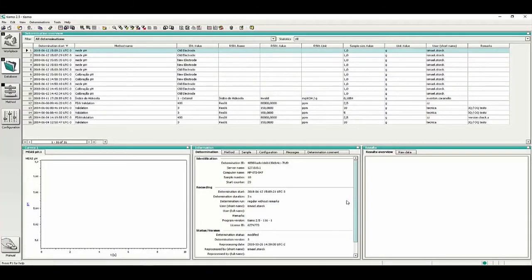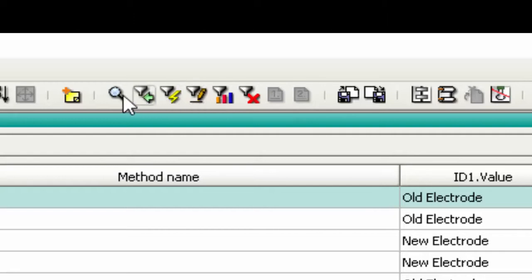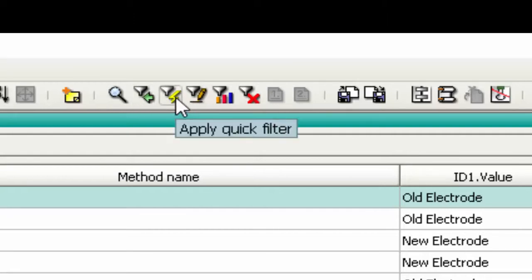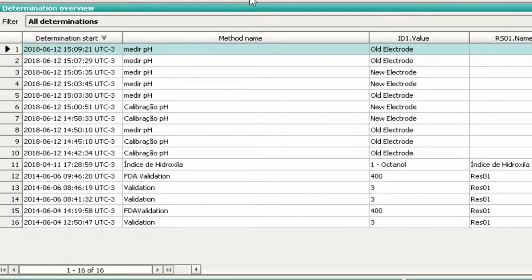In the upper menu, we have some buttons to filter the determinations of the database in order to facilitate the manipulation of the information. The quick filter is the best way to get started understanding filter tools. Just click on the button and then double-click on what you want to filter.